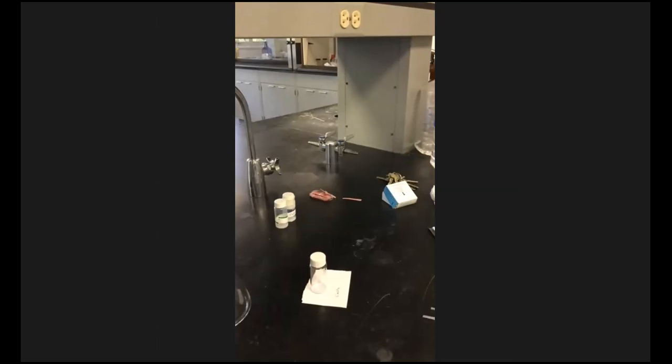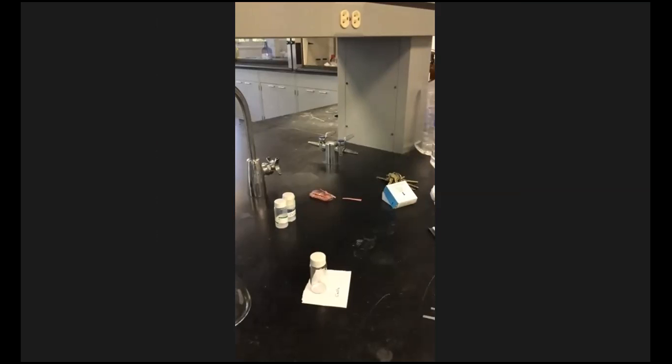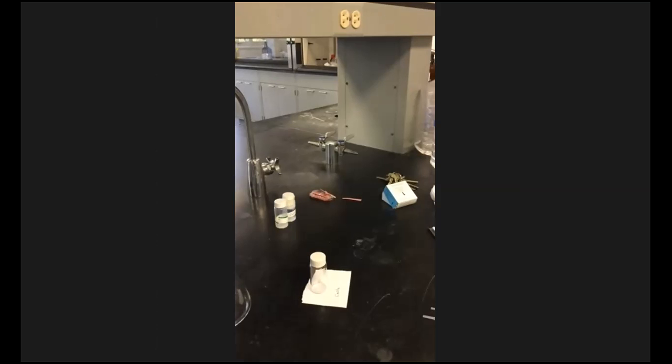So I'm going to include that number in the Excel sheet that I send you. Yeah, the mass of the filter paper is 0.18 grams. But all that's going to be in that Excel file. So anything you didn't get, you'll have it when I send the Excel sheet or when I upload it.